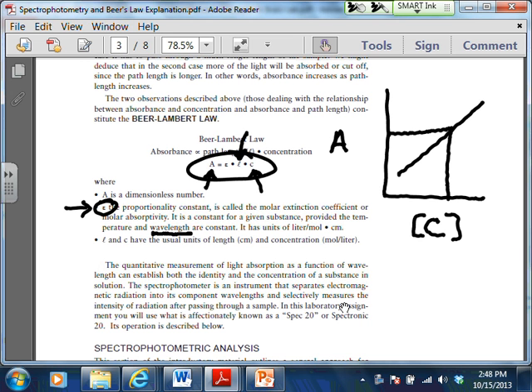That should give you the concentration of copper in your unknown. Okay? So simple as that. So once you figure out that concentration, then you can do the final calculations to figure out the mass percent of the copper in the brass solution, because you can work backwards from the concentration to figure out the number of moles of copper that you had in that solution.